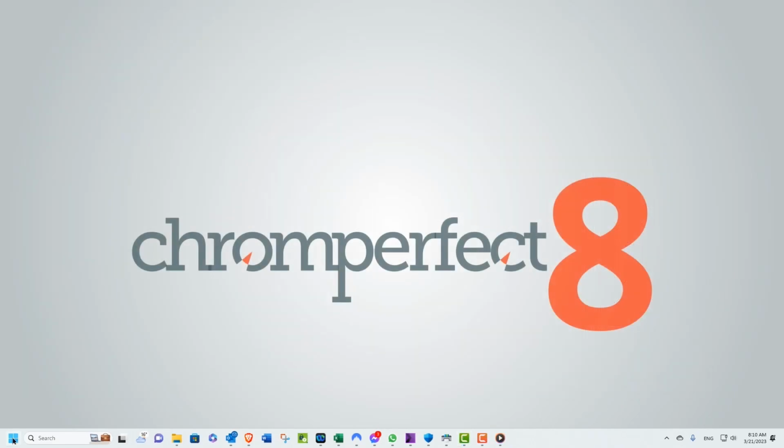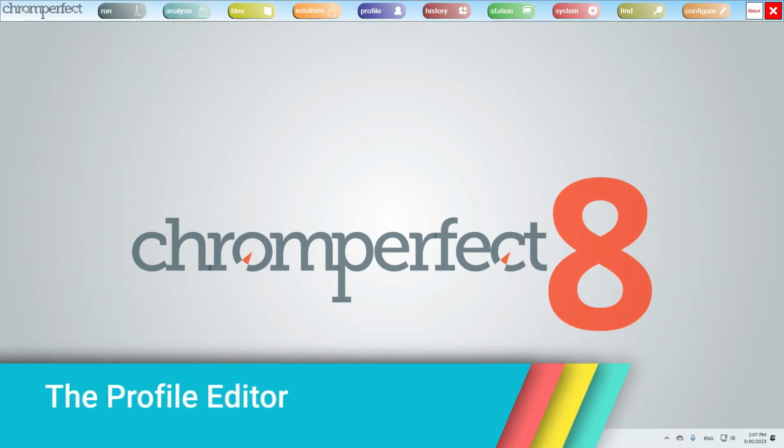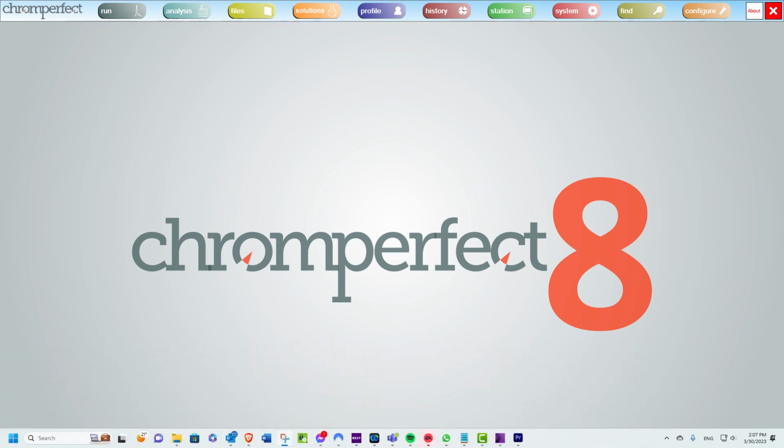This video is part of a wider chapter looking at specific Chromperfect features. The User Profile Editor program. The primary purpose of the User Profile Editor is to specify any number of search directory paths. These paths make it possible for the user to specify file names without bothering with the path. Chromperfect will try to find the file in the search directories and will prepend the path of the first search directory that contains the named file.